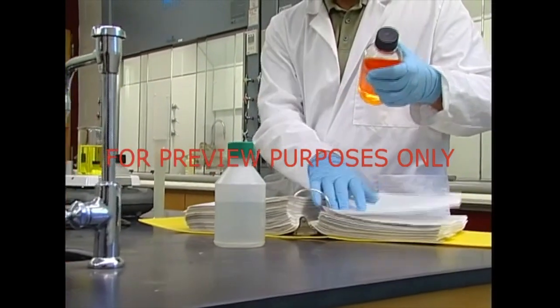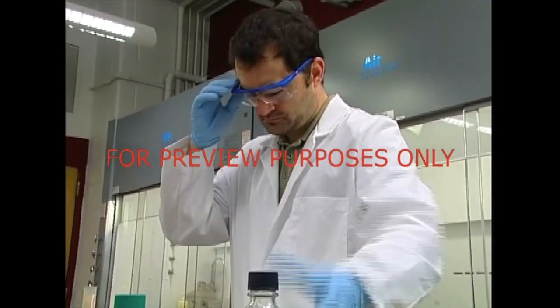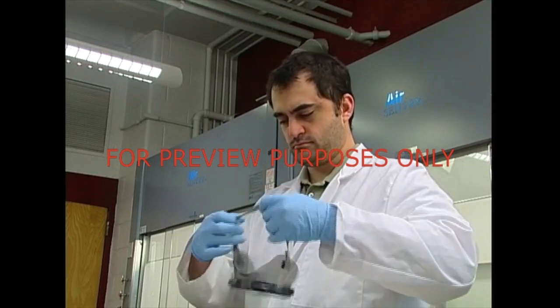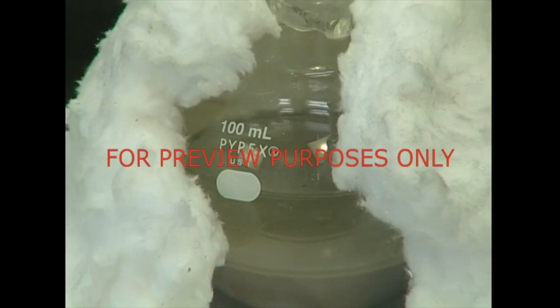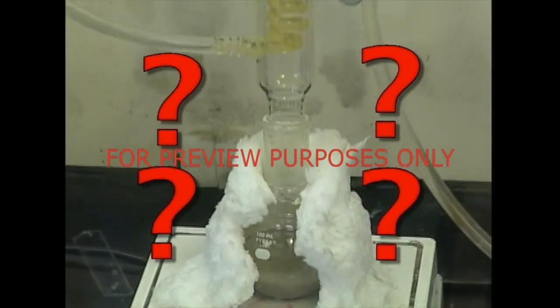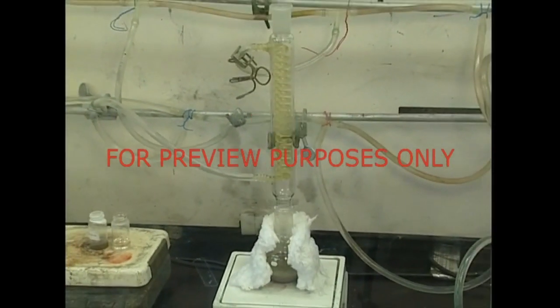Some experimental compounds may never have a written SDS. This doesn't mean there isn't a hazard. Make sure to determine the material's properties and take all the necessary precautions. Unauthorized experimentation, though, is never permitted. If an accident occurred and you weren't in the lab, no one would know how to handle it.